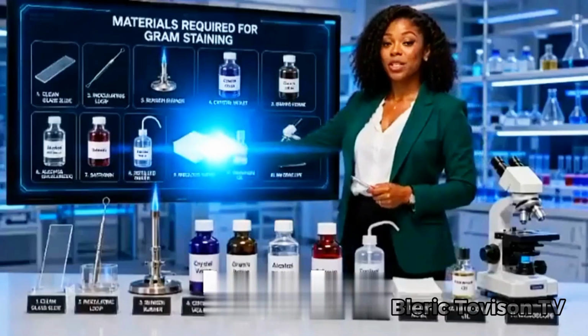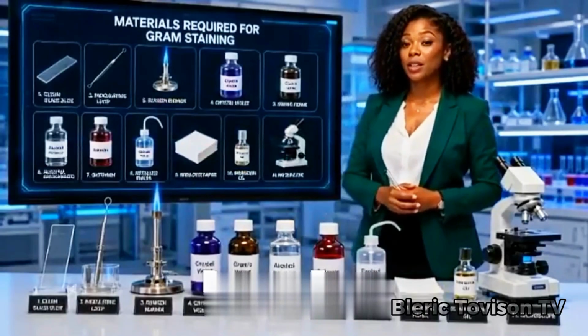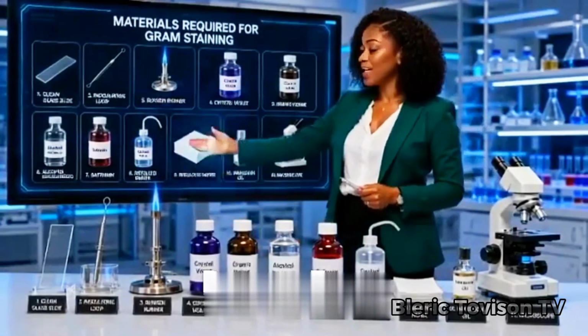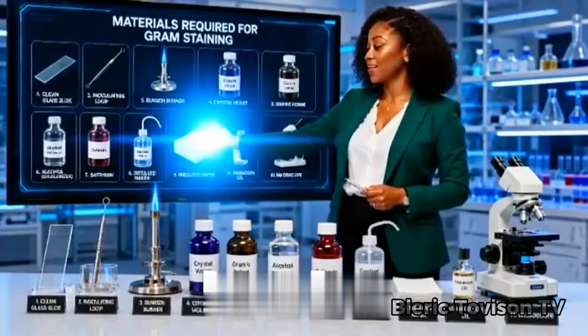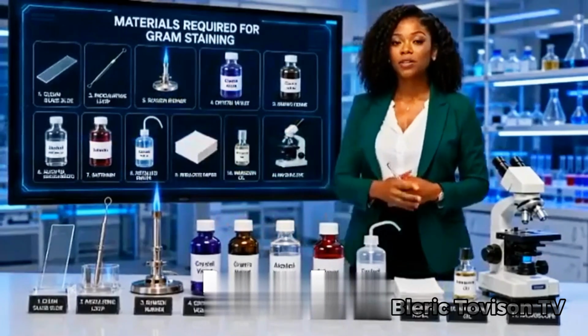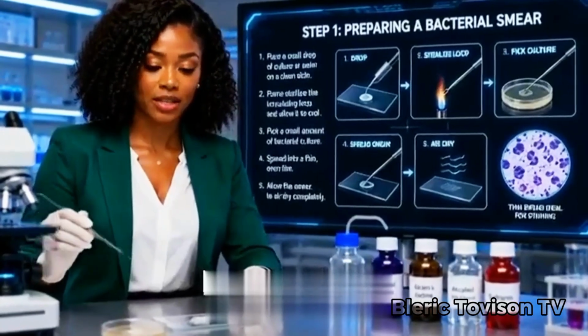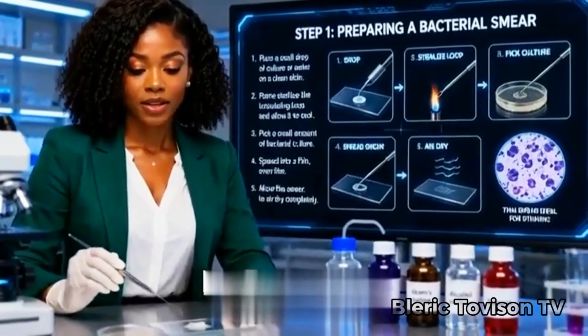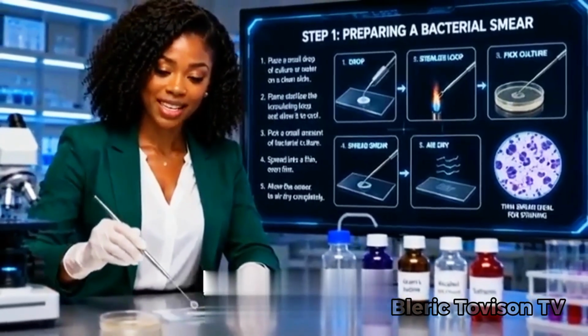Before performing the procedure, the laboratory scientist prepares all the necessary materials, including a clean glass slide, inoculating loop, crystal violet, Gram's iodine, alcohol, safranin, distilled water, and a microscope. The first step is preparing a thin bacterial smear on a clean glass slide. A small amount of bacteria is spread evenly and allowed to air dry completely before any staining begins.